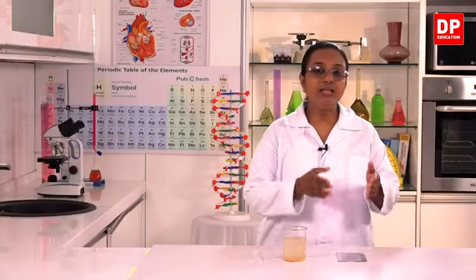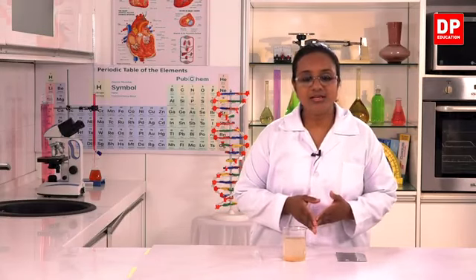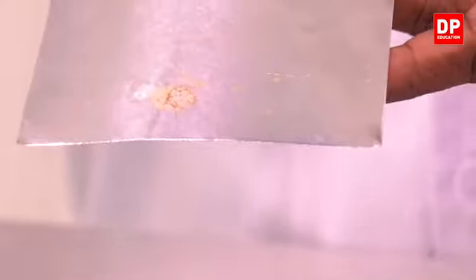So, if we take this metal plate and heat it, maybe using a candle, then we can see how the particles are distributed in this mixture. So, let me do that now. So, now students, I have the plate after heating it. Now, you can see here, this side we don't see any mark.